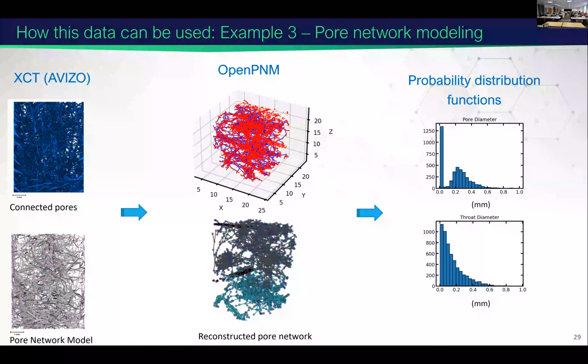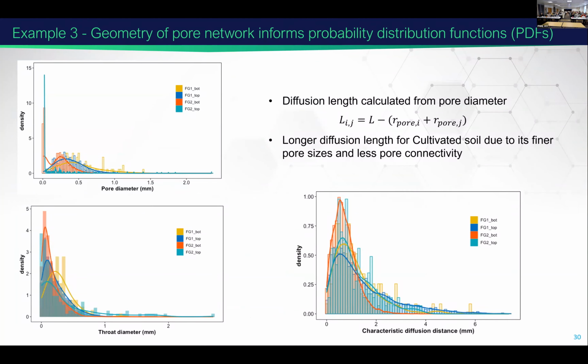And this type of analysis is very useful for simulating diffusion lengths, for example. The diffusion will depend on the connectivity of the pore network.